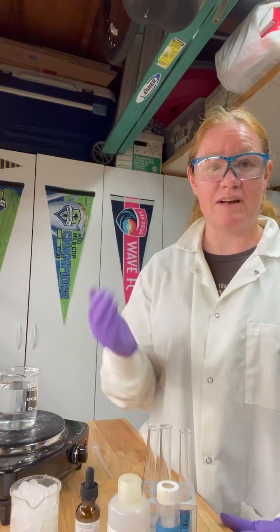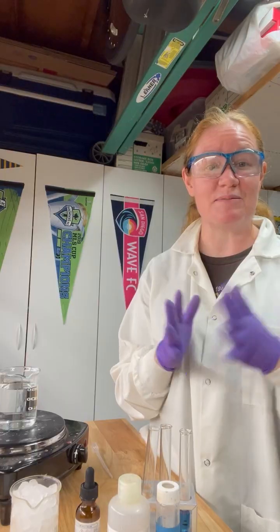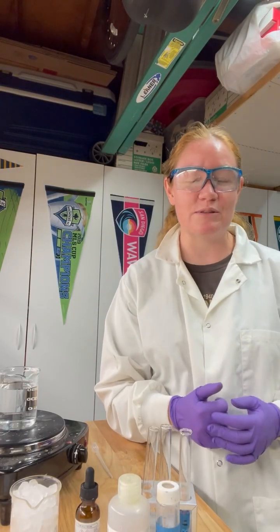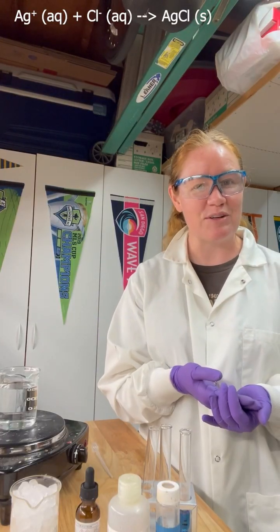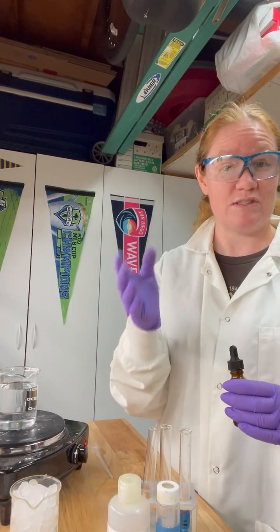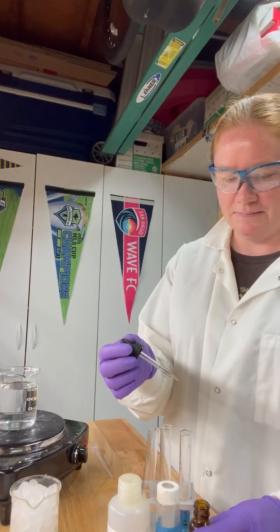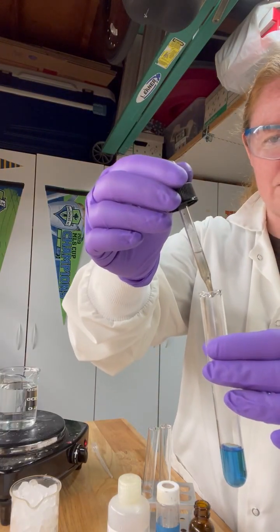Silver nitrate, when added to a system with chloride ions, is going to give me a precipitate, because silver nitrate, if you recall, is going to be silver ions and nitrate ions. If you remember your solubility rules, what happens if we have silver ions and chloride ions? We make insoluble silver chloride. So as we add the silver nitrate, what we should see is a solid precipitate form, which is our silver chloride, and a shift back toward the pink. Because I need to produce more chloride ions in order to reestablish my equilibrium.